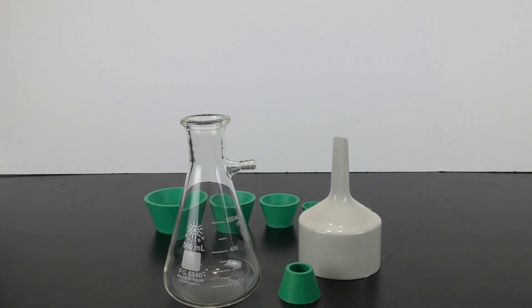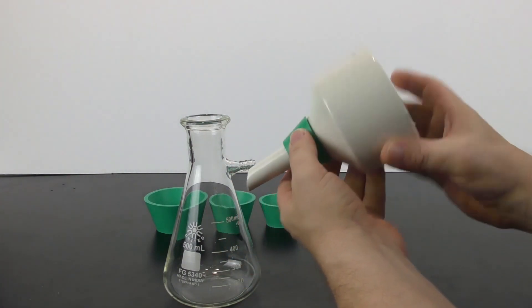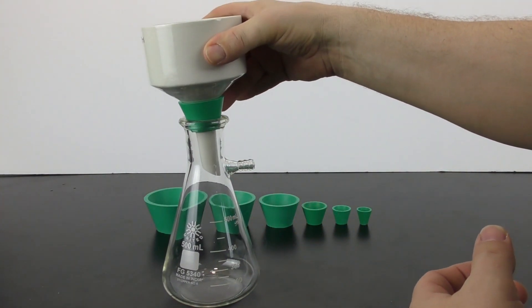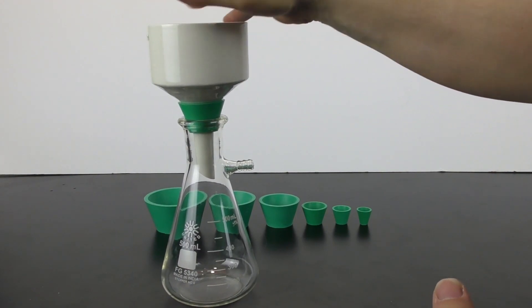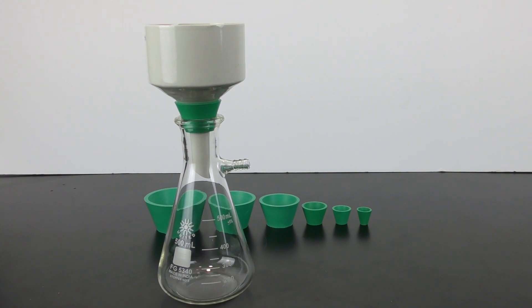The setup for this is very easy and straightforward. You pick the appropriate size filter adapter, place it onto your flask, push it down to make a nice seal, and then you are all ready to run your experiment.